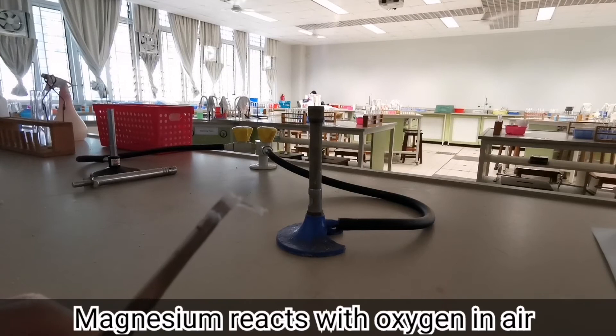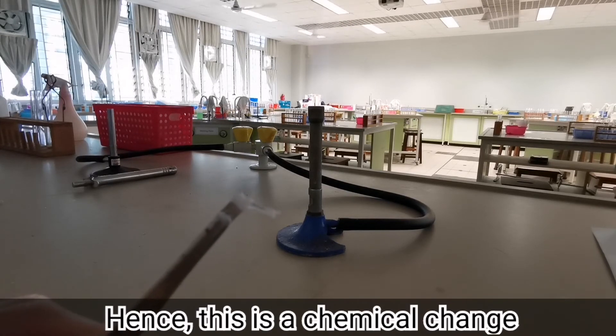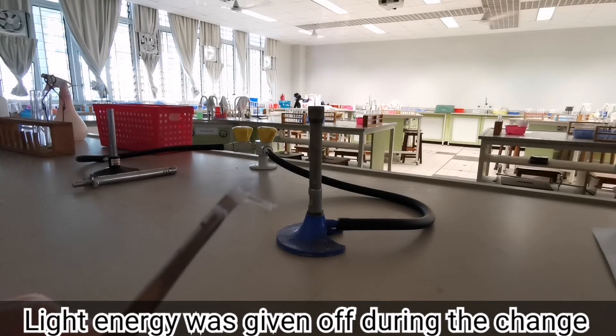So magnesium actually reacts with oxygen in the air to form magnesium oxide, a white solid. Hence, this is a chemical change as a new substance has been formed after the reaction and it gave off light energy in the process.